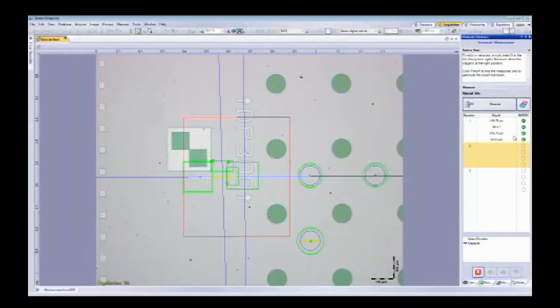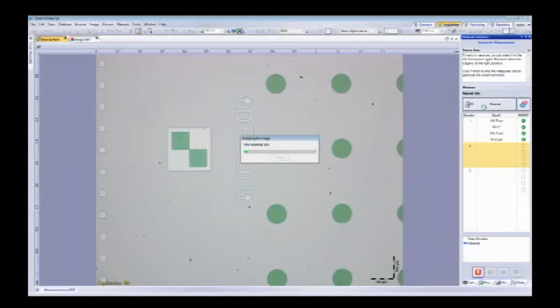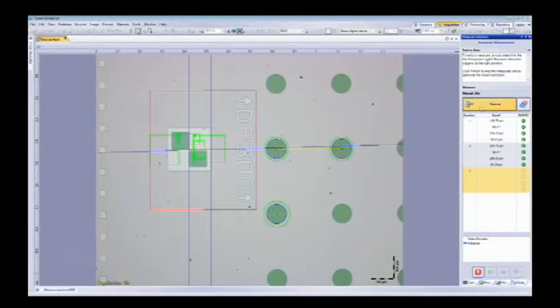Now they'll probably move to several new points on the sample. And you can see that this new point, it's close enough, it's within the field of view, the pattern's there, so it'll automatically find it. It's going to automatically find that pattern for us and mark all the measurements again. Show us the layer thickness measurement.